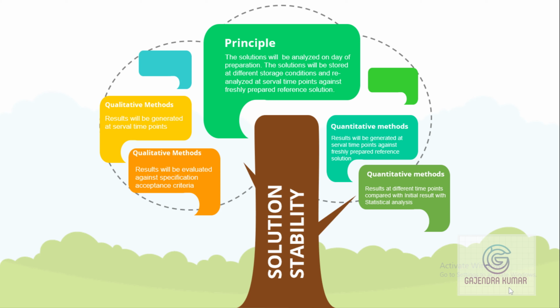The reason for this recommendation is we don't know the time gap between the sample preparation and the results generation or observation. So generating solution stability data for at least 2 or 3 hours will give authenticity to our results. So as I explained, in solution stability, we are storing our solution under different storage conditions.